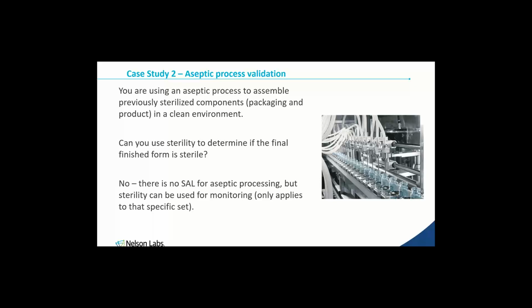No, but I would probably say that, because we haven't talked about the filling process validation yet. You did mention that all the components would need validations to show that they were achieving sterility that way. But just to give you an idea, because we have seen a few of these, when you're doing a process filling, aseptic filling validation, again, you're not looking at sample sizes in the 10 to 100.